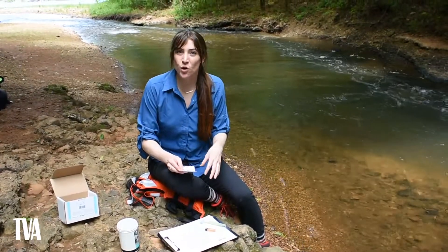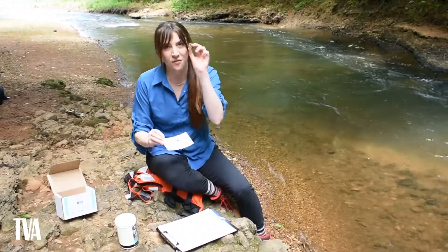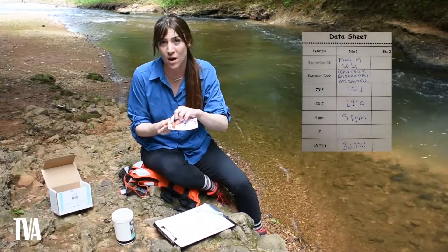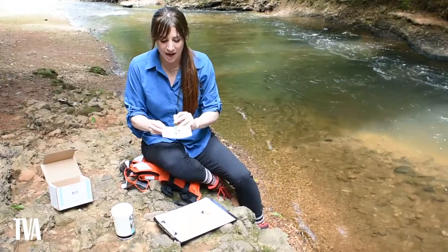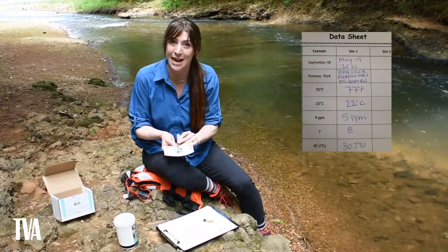Now that our chemicals have rested, we'll record the remaining data using the comparison card. Line up your vial on the dissolved oxygen section and see whether it most closely resembles zero ppm, four ppm, or eight ppm. Mine is darkly colored so I'd estimate between four and eight — draw a conclusion and write it on your data sheet. Then line up your test tube in the pH section of the comparison card and determine what color it most closely matches. I think mine is closer to an eight, so I'll write down eight on my data sheet.